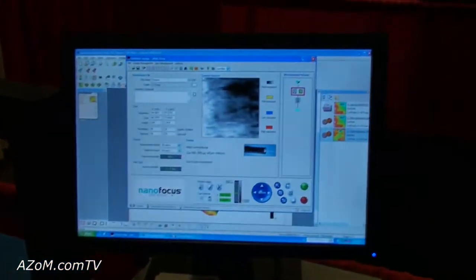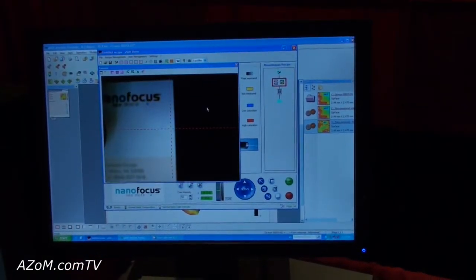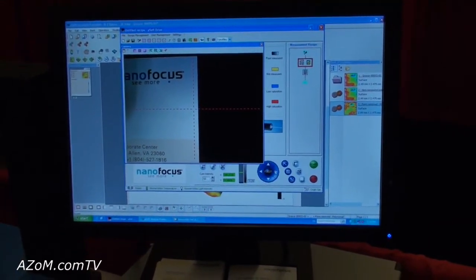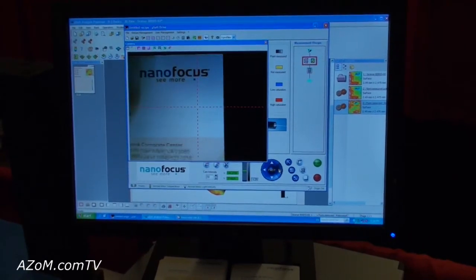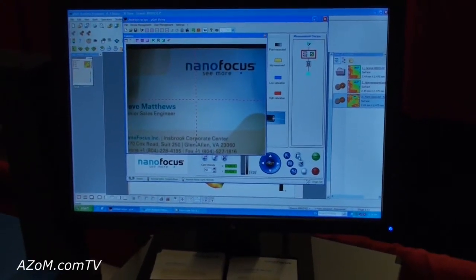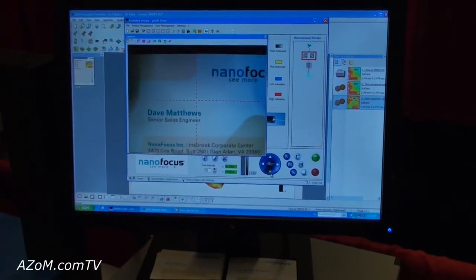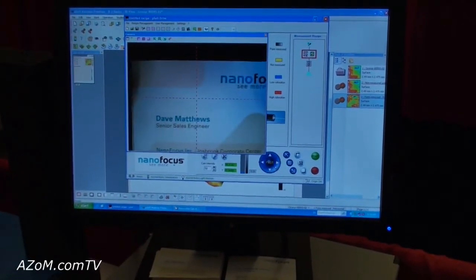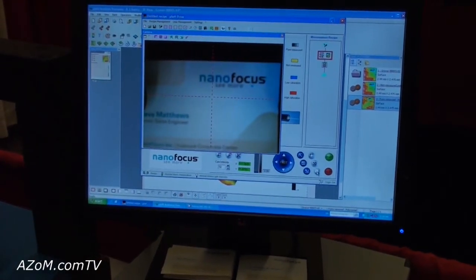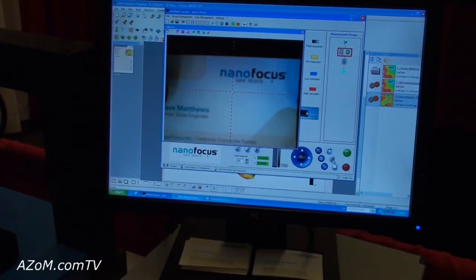The middle section is not a sensor — it's a real-time autofocus camera. Using the stage controls, I can set my measurement points using the camera. So you could effectively locate an imperfection and then measure exactly that location — that's what the camera is for.